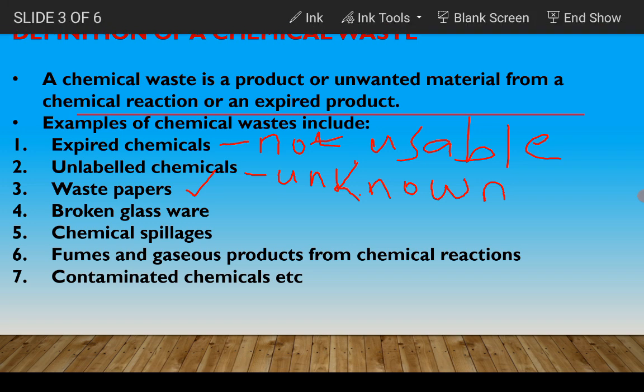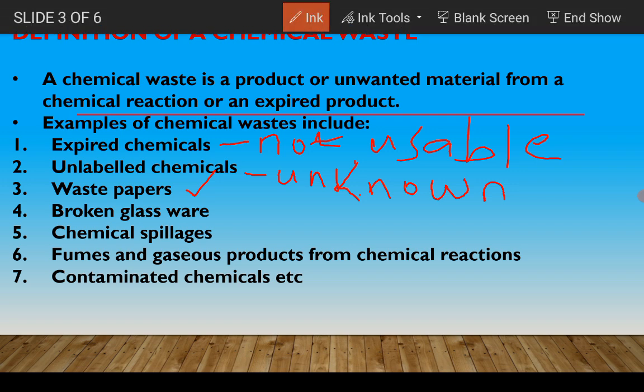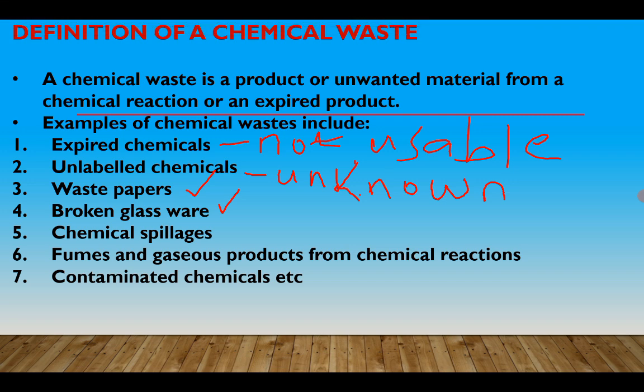Broken glass, like broken test tubes, broken beakers, broken syringes, broken burettes, pipettes, and all glassware are considered to be wastes in the lab. So they need to be carefully treated and disposed of so that they don't pose a danger to you, the user of the laboratory. All right.